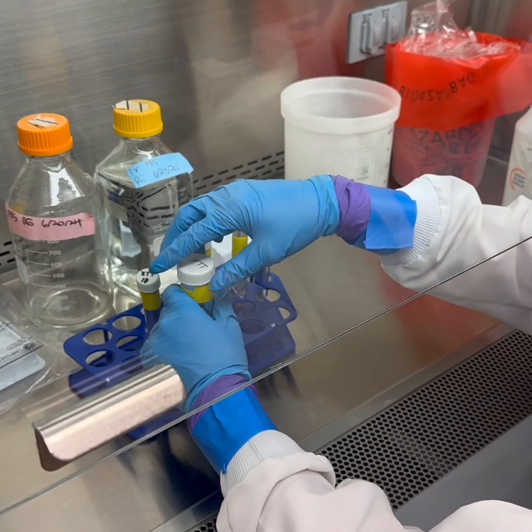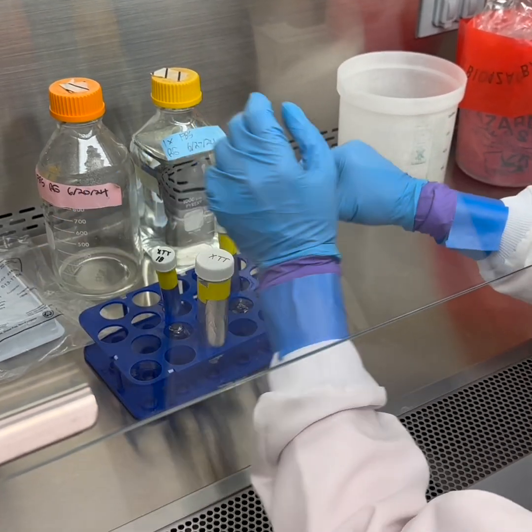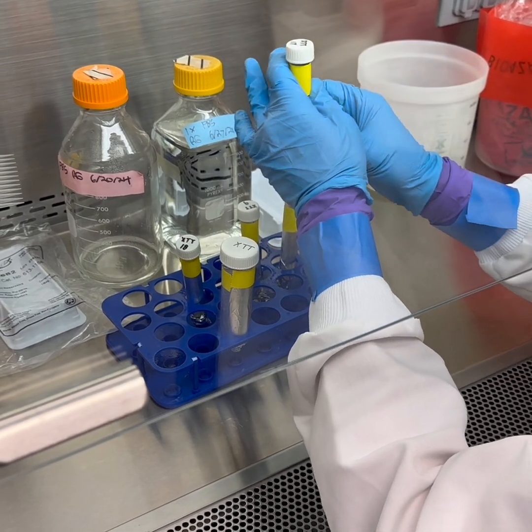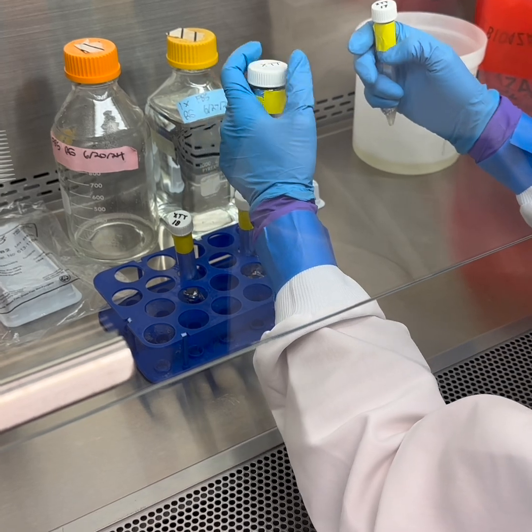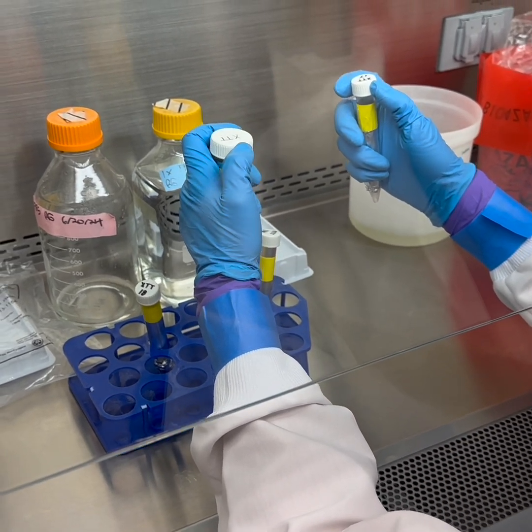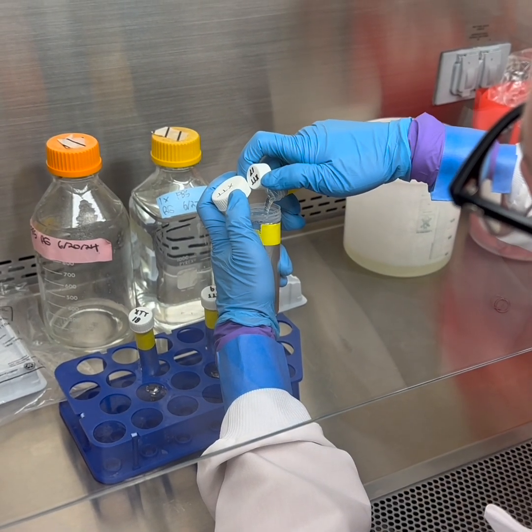Okay, so now we're making our XTT after we've washed our plates. XTT is light sensitive, so all that I'm going to do is we've made 10 milliliter aliquots and frozen them at -80. I'm going to combine all of them.